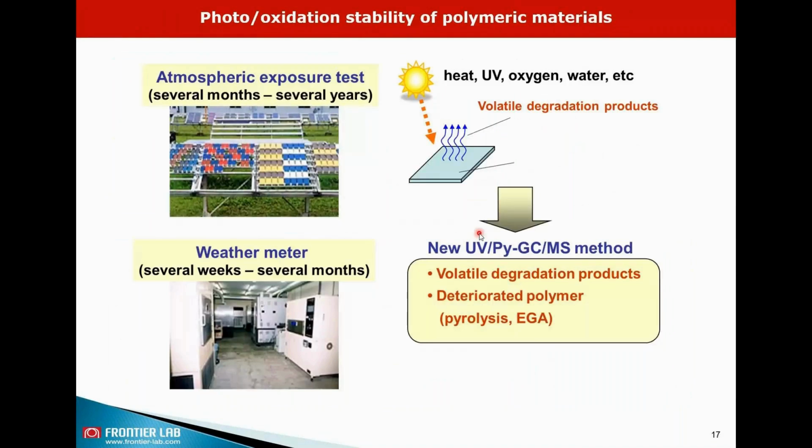Okay, now I move on to the second part of my applications. I think previously Dr. Michael has shown about the UV radiator. That is something we have developed as an accessory, which allows to do the kind of online photo degradation of polymers. Okay. Now, the first question one may have, why we need this?